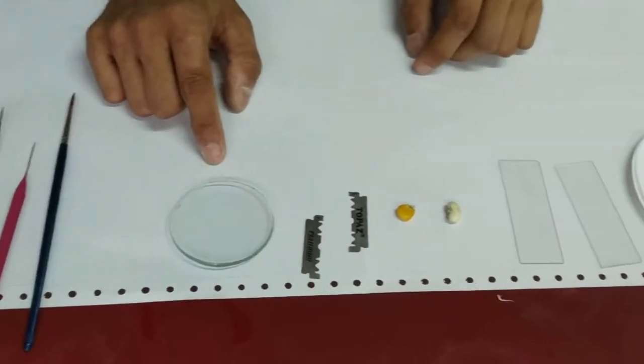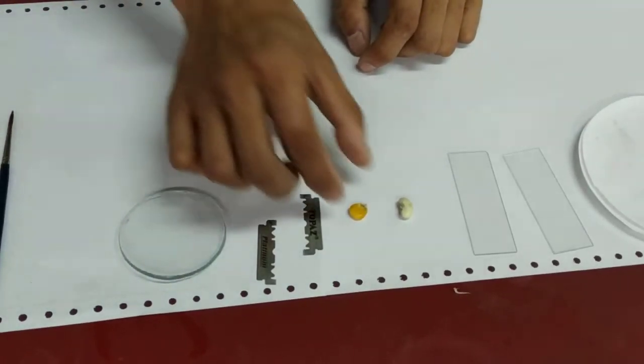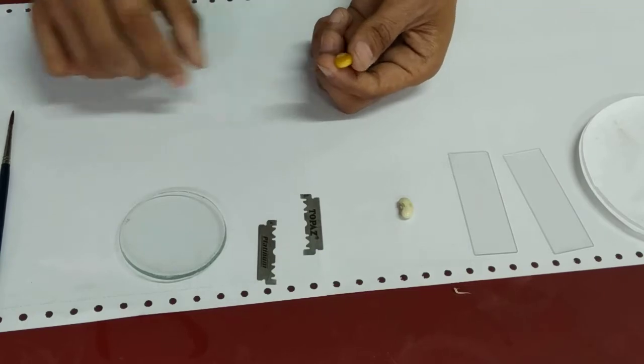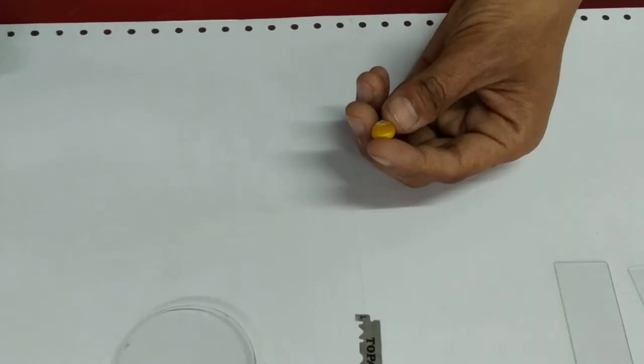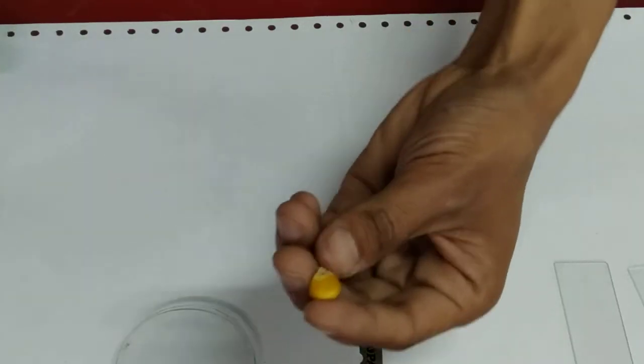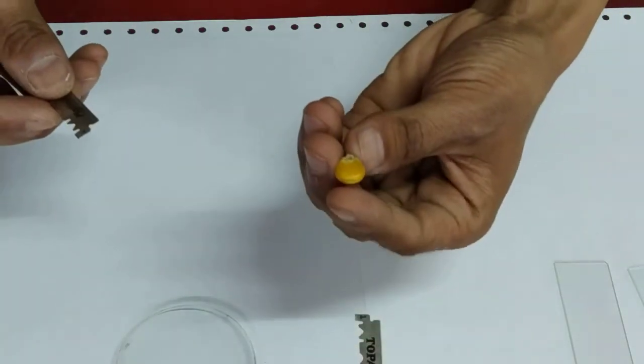Slides and filter paper. So the first thing we are going to do is we are going to cut the longitudinal section of maize seed.